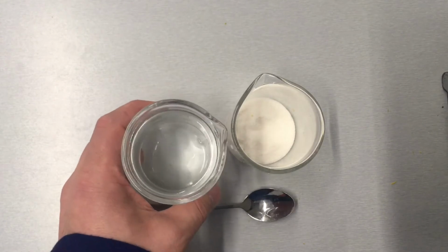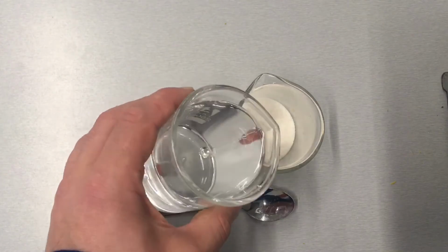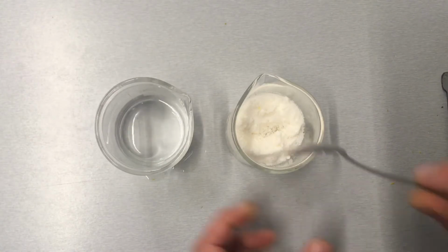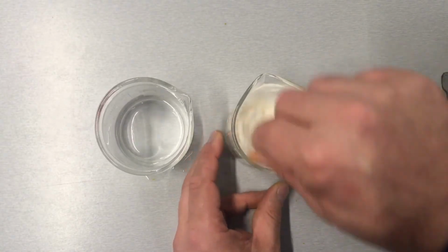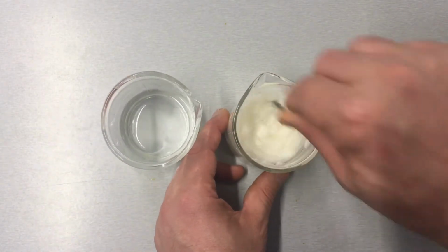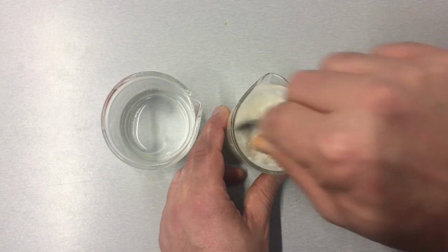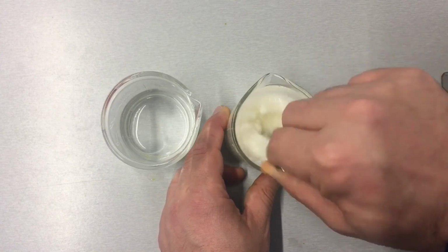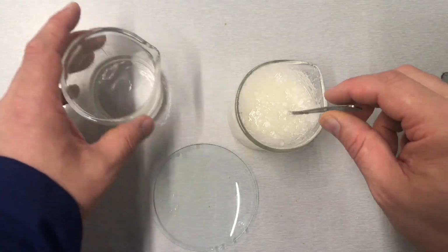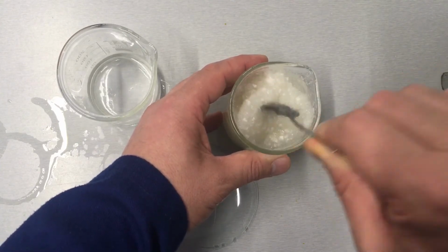So obviously record your initial physical traits. And then I'm going to pour the water in. And we're going to give it a bit of a mix. Obviously water is water in terms of your description of how that looks, but now I'm just going to mix this powder up. Okay, so just observe what you can see with the methylcellulose powder, dry powder, and the water mixing.